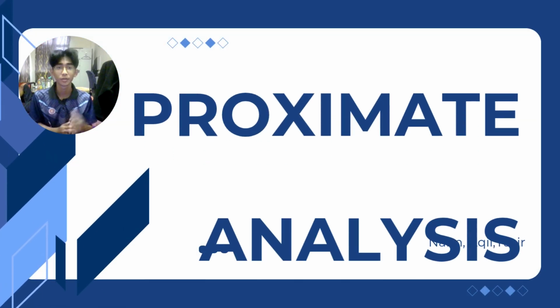Hello, today our group will be explaining proximate analysis that we conduct in the laboratory.